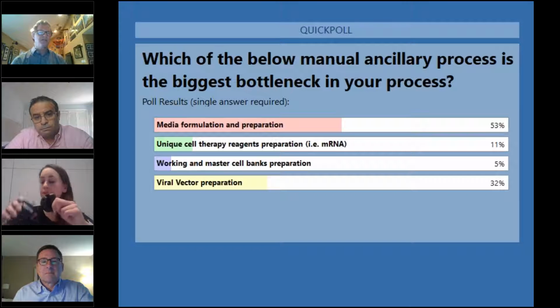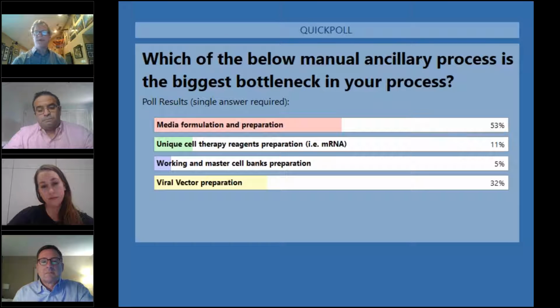And so what we found was that there was just not very much automation specifically designed for that kind of space, whether that is the kinds of materials that were necessary, the manifolds, the sizes of the bags for holding materials, the size of the interfaces, aseptic connectors, and welding lines. And so that was our biggest challenge: we had to get into a design-build arena to get these kinds of automation systems developed appropriately for our autologous space. So I think that was one of our biggest challenges.